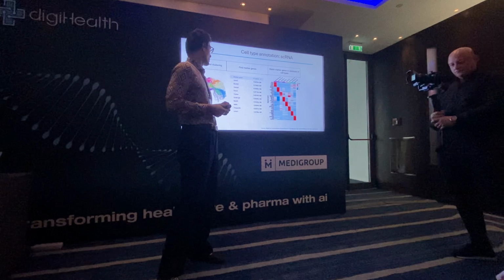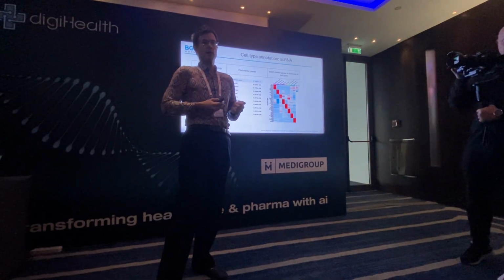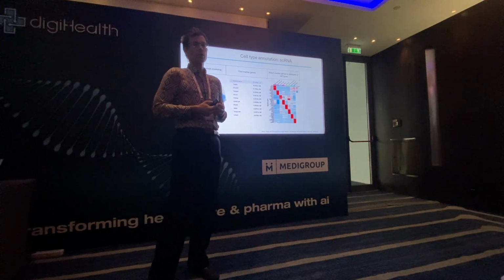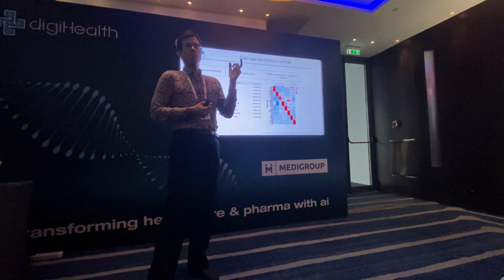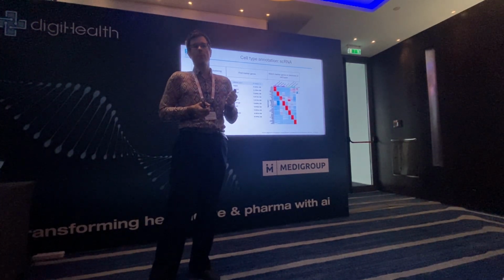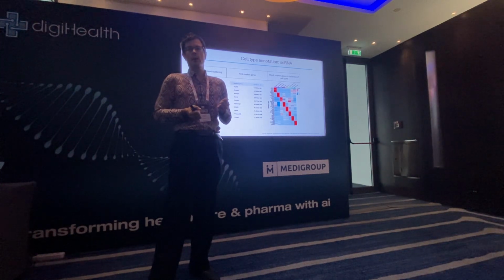But for spatial transcriptomics, this flow doesn't work. Why doesn't it work? Because of the limitations of this technology, and the limitation is the existence of gene dropout. So actually, in all of the spatial transcriptomic technologies, we are not able to obtain the full landscape of gene expression for every cell. So we do not get all the genes in the cell. We get like 20–30% of it at top, and the rest is just gone. So for the rest, we don't know whether it's 0 or we didn't capture it during the sequencing process.